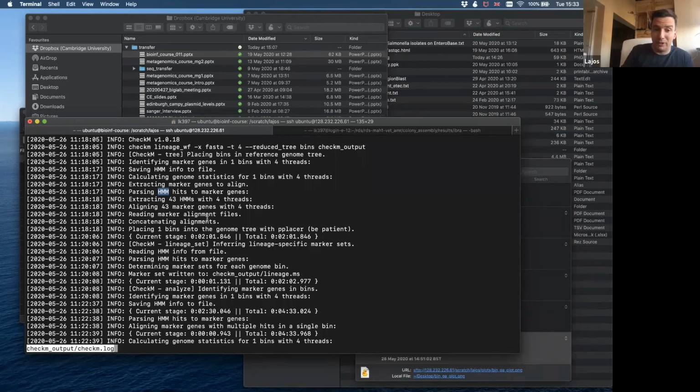And we simply sequenced more than one species. In a few cases, we sequenced two different genomes. I think in 1 or 2 cases, we actually sequenced 3 different genomes. So what you will see in this case is that I have several duplicates. If you are sequencing multiple genomes, that means that probably all of these 43 genes will be there as duplicates.